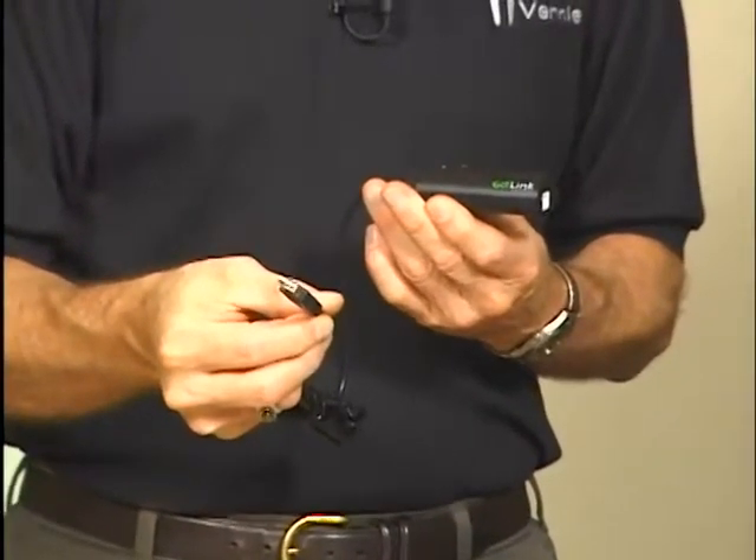It plugs directly into USB, only supports one sensor, and you're limited to 200 points per second. But it's a very low-cost solution which we promote for middle school and elementary.